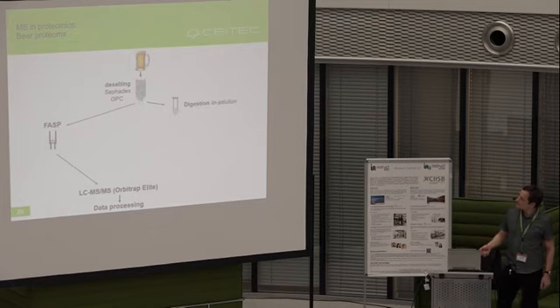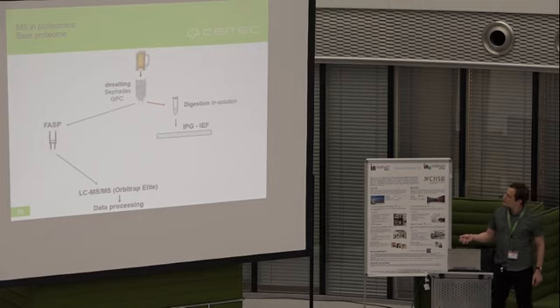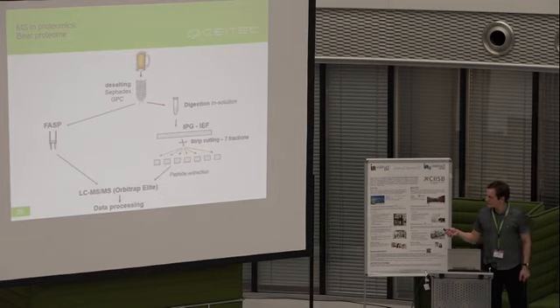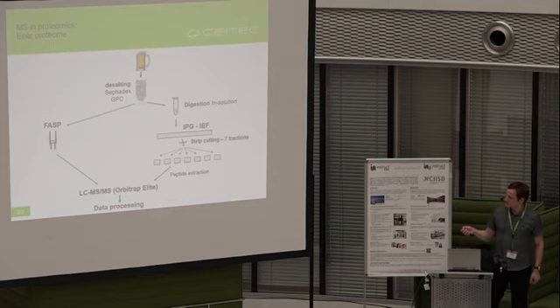However, we also tried another methodical setup where we involved isoelectric focusing of digested peptides of beer, and then the strip of IEF was cut into pieces and the peptides were extracted, and each fraction was again analyzed by LC-MS with an Orbitrap mass spectrometer.